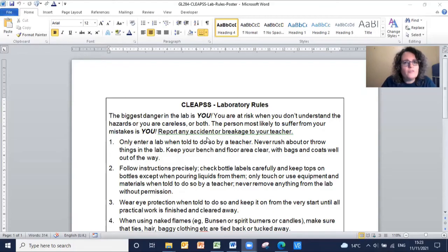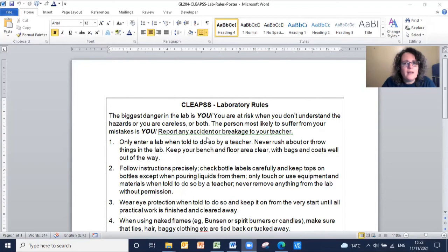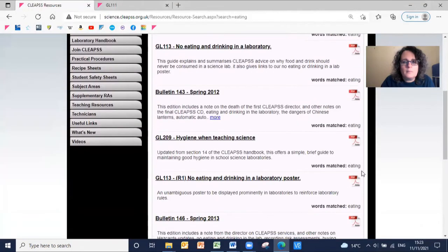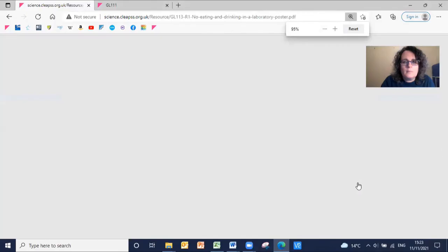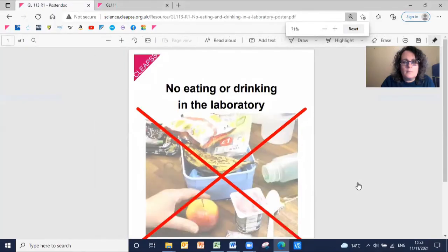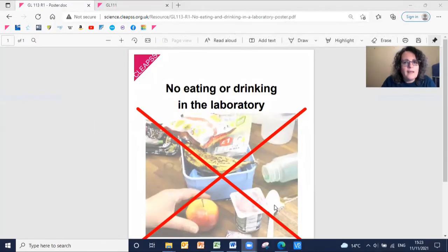Another common request we get is for a lab rules poster. Why not display this along with our no eating and drinking poster? As we often get asked for help with this by technicians as well.